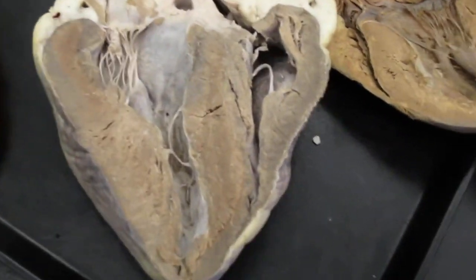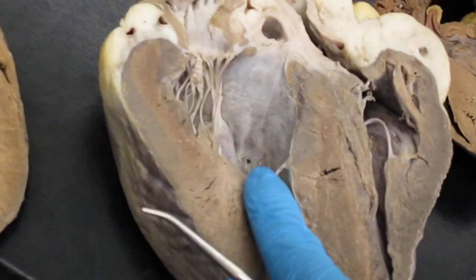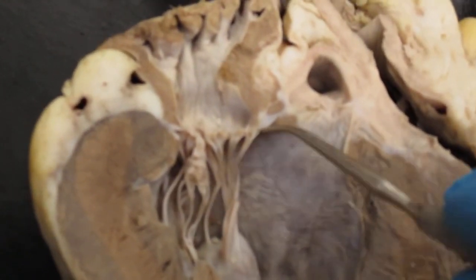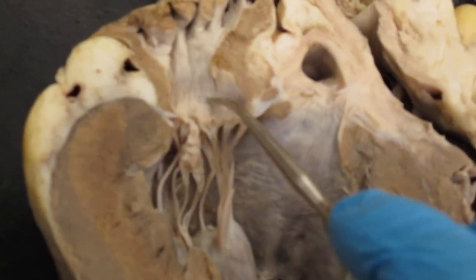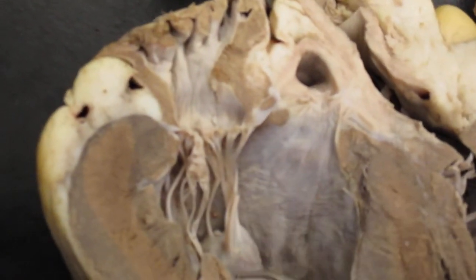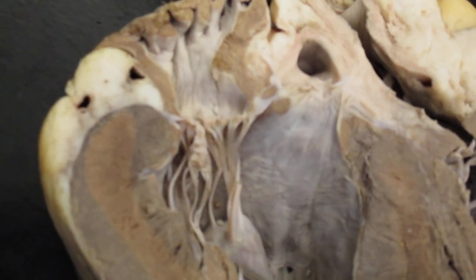Right here we have the ventricle, left side, and ventricle, right side. Right here you can see the cusp of the bicuspid valve, or mitral valve. You can see the chordae tendineae and the papillary muscles.